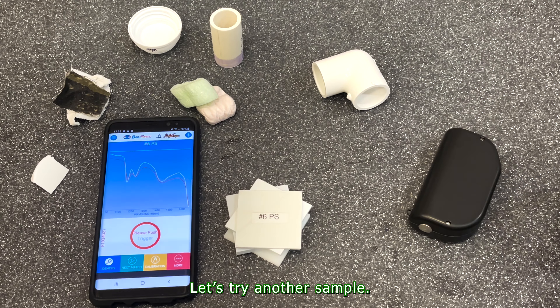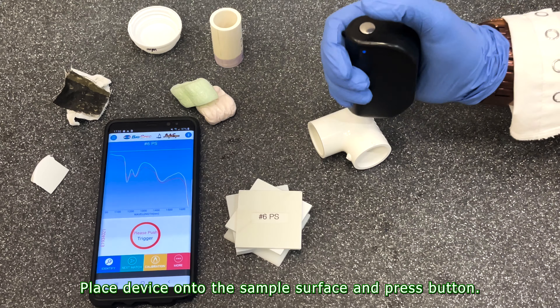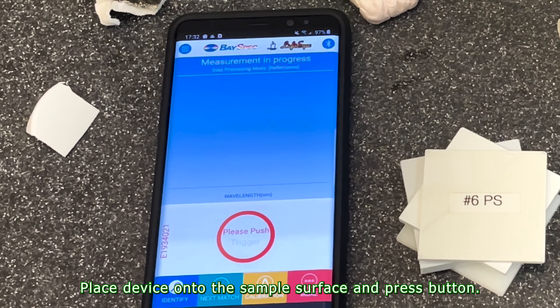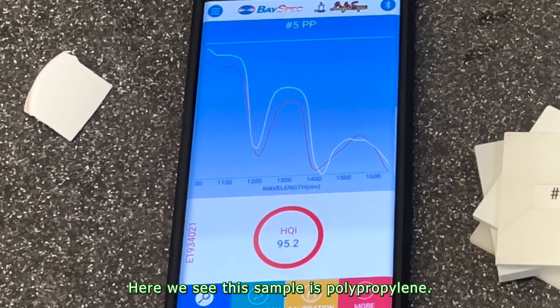Let's try another sample. Place the device onto the sample surface and press the button. Here we see the sample is polypropylene.